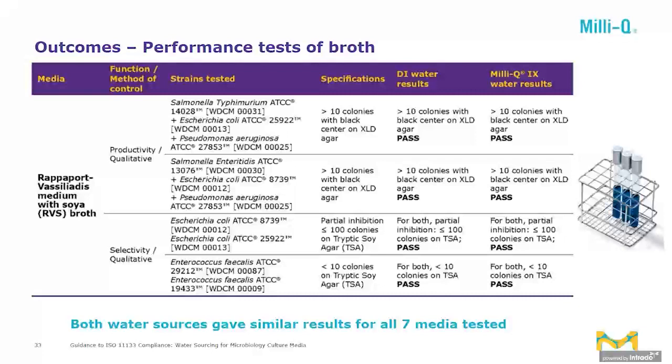But just one last thing I wanted to mention is there are some additional features of water purification systems that can really help you increase your lab's efficiency and productivity. For example, you can have a foot pedal that will allow you to have both hands free to work, so you don't need to touch the dispenser to get water, you just do it with your foot.